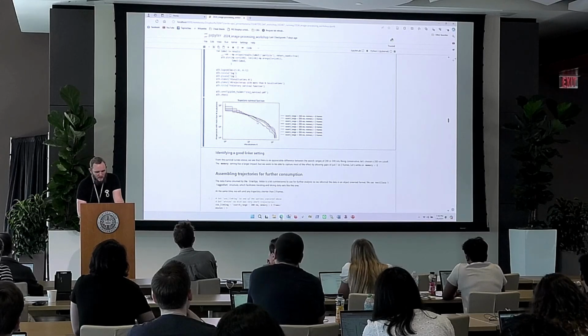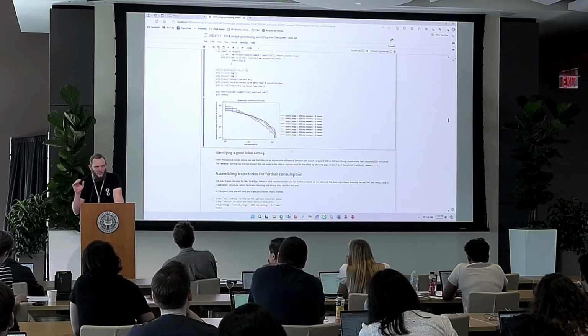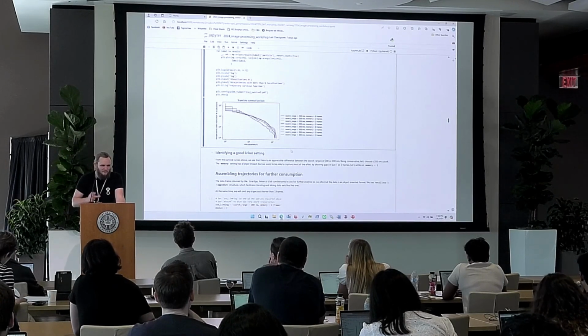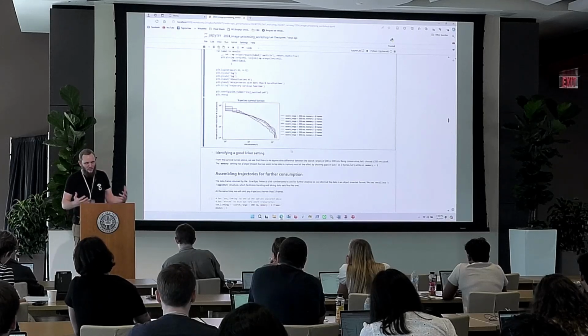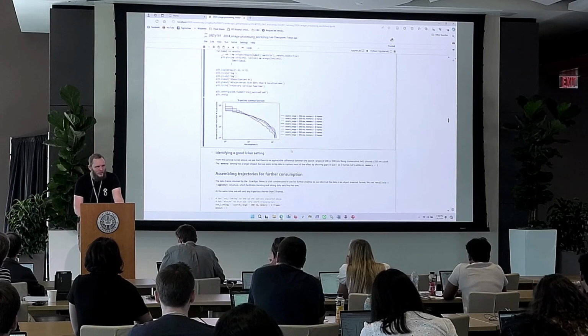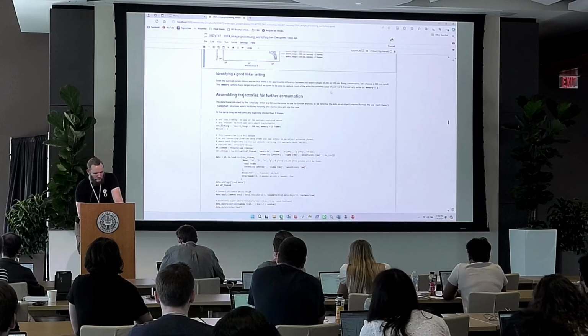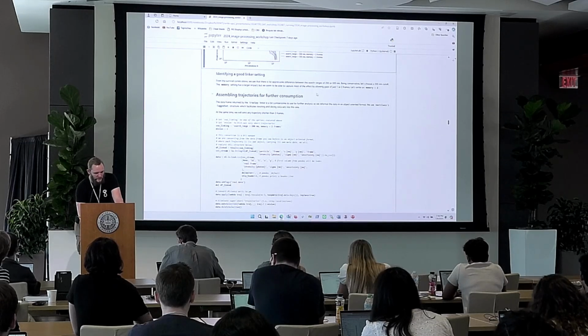There's still a little jump here. So what I do in this example is I set the memory to 2 frames. That seems to be the point where things converge. Just setting it to 2 frames is basically the most conservative thing we can do while still taking everything that we're reasonably sure of. Cool. So that's basically what this paragraph here says.